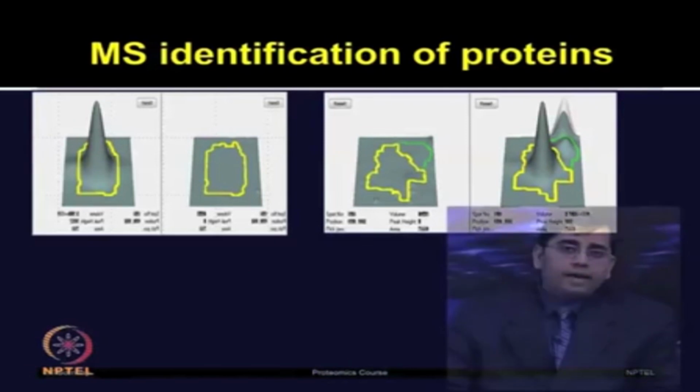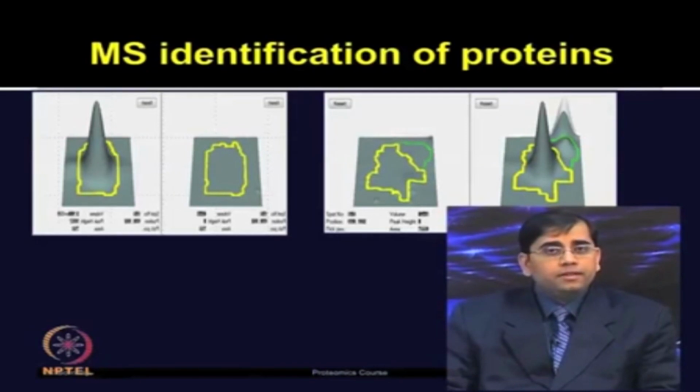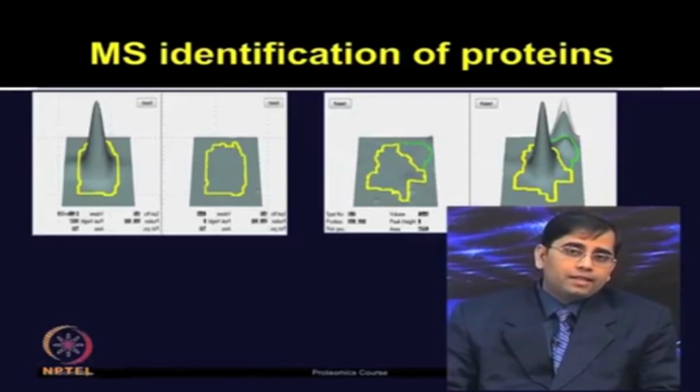Now, after the identity of these proteins were established, the 7 proteins which were not detectable in the healthy controls and only observed in the SARS patient, the identity of those included glutathione peroxidase, PRX2, retinol binding protein, vitamin D binding protein and serum amyloid A proteins.